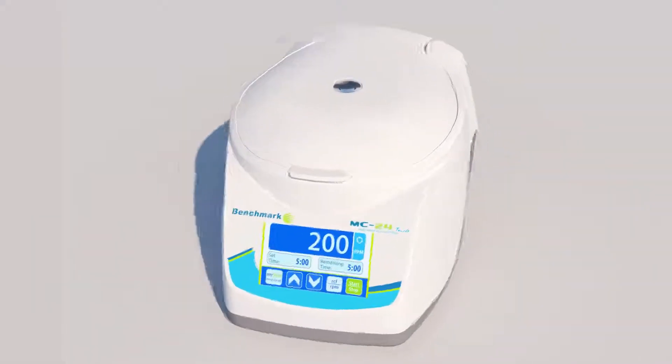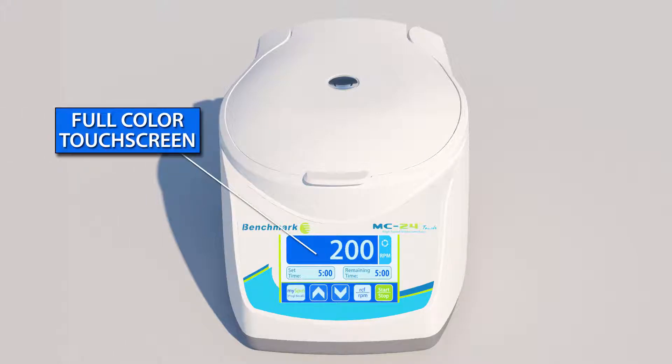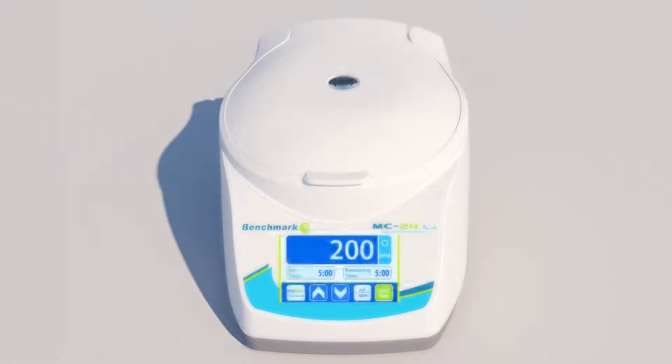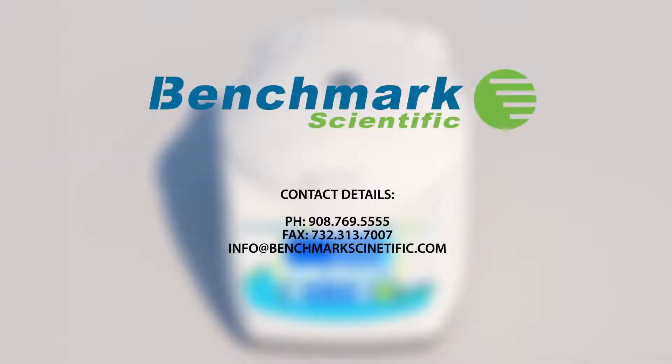The MC24 Touch is the first and only high-speed microcentrifuge with a full-color touchscreen, and is the perfect companion to any modern laboratory.